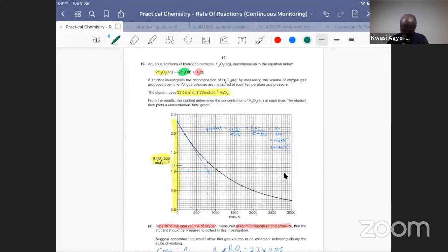And if we go across to our curve and all the way down. Okay, so we've got T half there to be 900 seconds. Okay, and if we halve 1.15 again to 0.575, so 0.58 we're looking at, so 0.6, so 0.575 will be there.